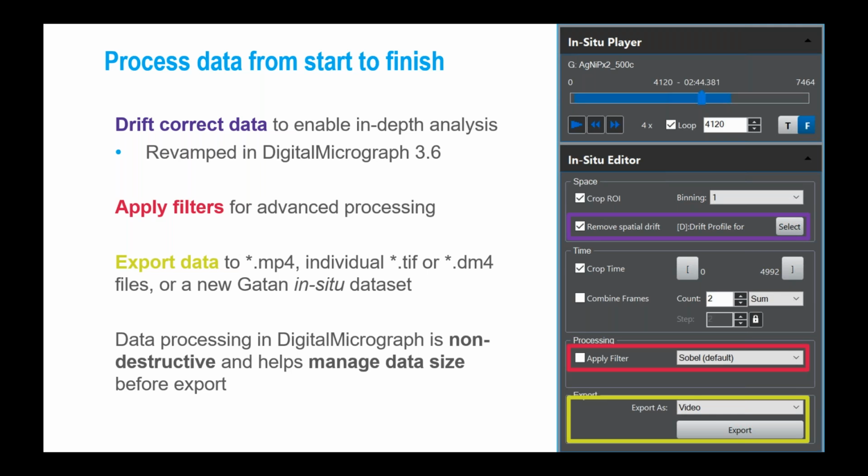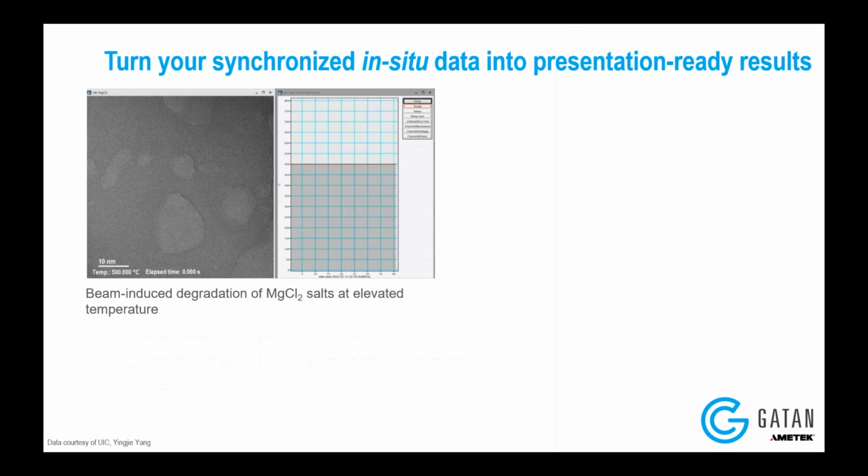Because with the camera, it's very easy to acquire hundreds of gigabytes of data in a single session. With these tools, by using the spatial editing and the temporal editing features of the editor, it's really easy to turn 100 gigabytes into 1 gigabyte or less of video that is very easy to put into a PowerPoint presentation, as we see here.